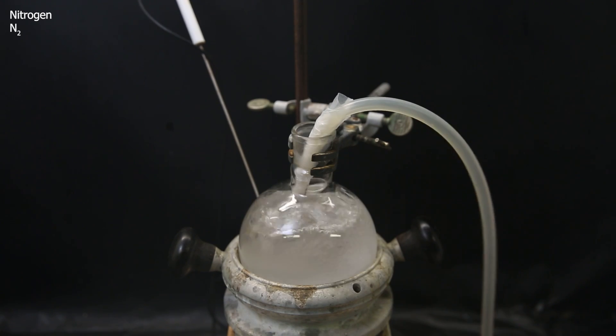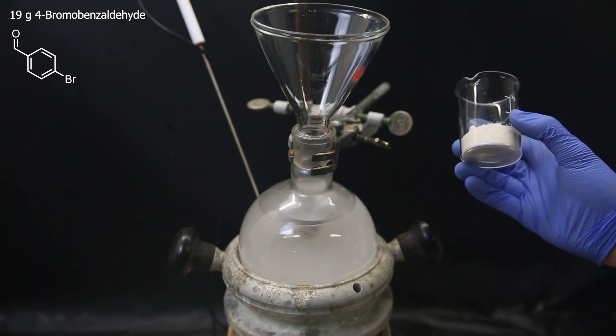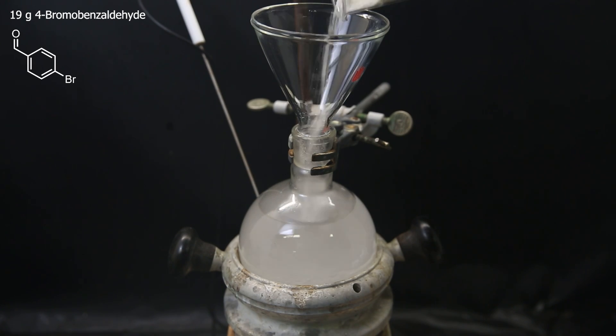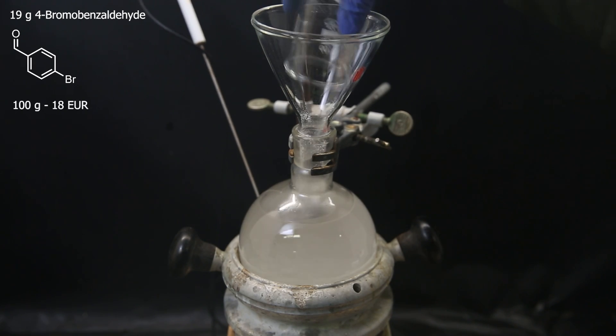I then degas this mixture by bubbling nitrogen through it, which will expel dissolved oxygen, which can interfere with the reaction and decrease the yield. When that's done, I add in 19 grams of the first reagent, 4-bromobenzaldehyde, which was very affordable.